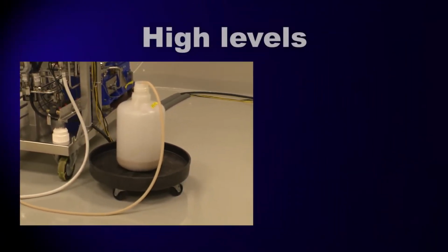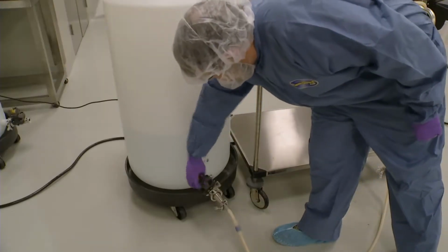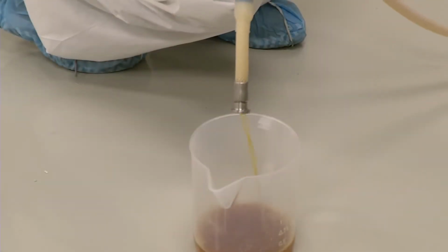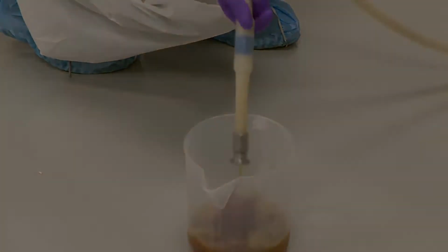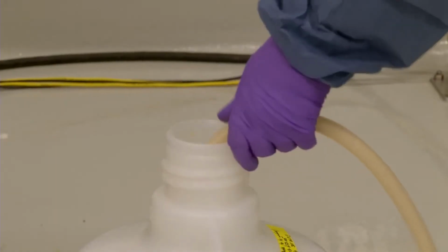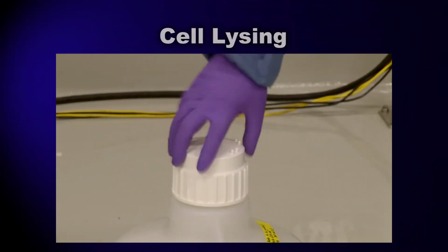The remaining liquid contains high levels of metabolites and salts that could complicate downstream processing, so we're going to lower those levels by washing the cells. The cell paste is suspended in a buffered solution, and then run through the centrifuge again. As the clarified liquid leaves the centrifuge this time, it carries many of the contaminants from the fermentation step with it. The cells, once again in paste form, are ready for the next step, cell disruption, also called lysing.